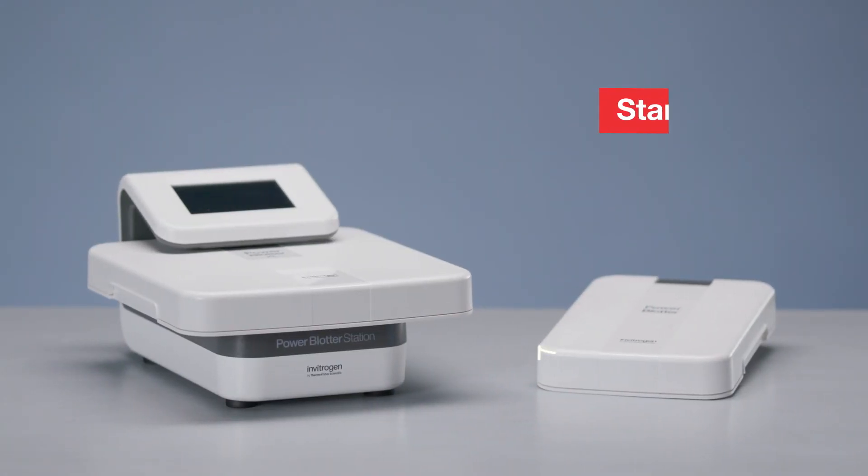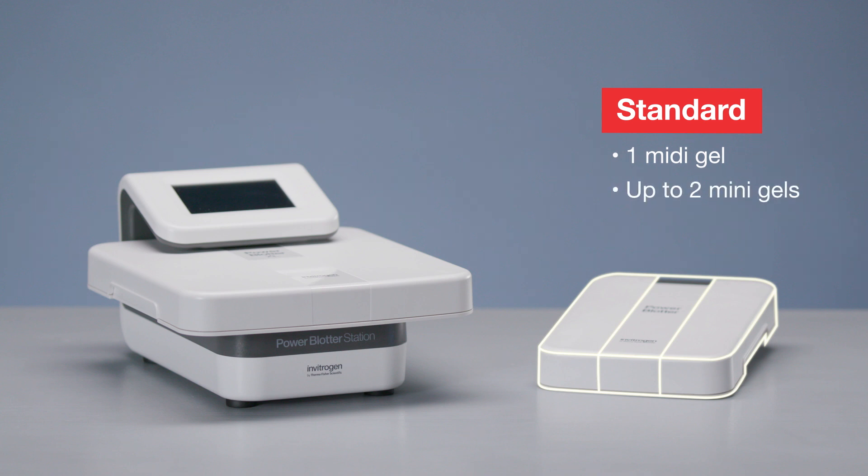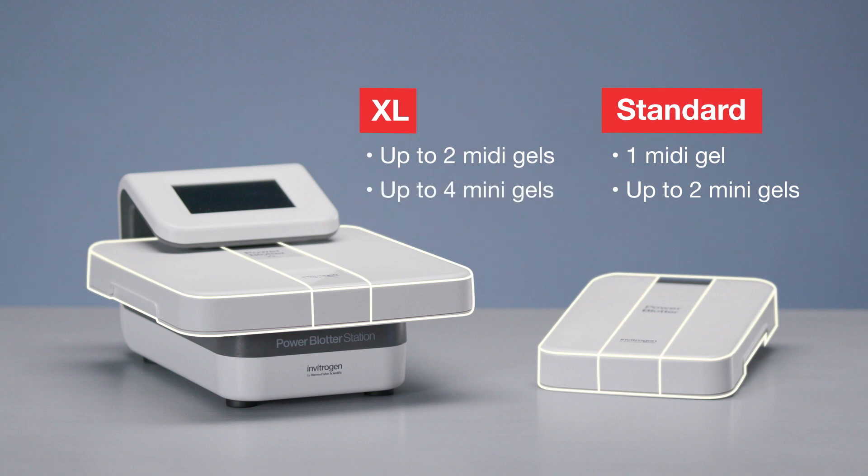The Power Blotter system has two different cassette sizes: a standard size for transferring one midi gel or up to two mini gels, or the XL cassette for transferring up to two midi gels or up to four mini gels at one time.